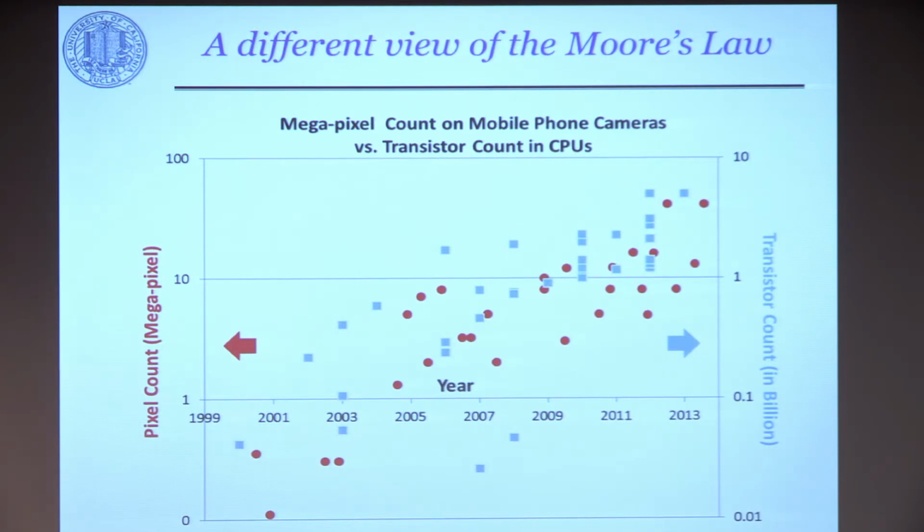A virus is about 100 nanometers. If you divide your human hair by 100 and then divide that by another 10, it's about a virus. So you can see individual viruses, and even a single DNA molecule can now be seen. I'll share examples of that. A microscope that is essentially converted from a mobile phone, a handheld device, that can see an individual DNA molecule. That's now enabled through the rapid progress that consumer devices, in particular mobile phones, enabled.